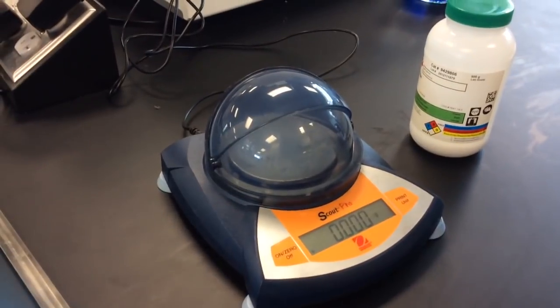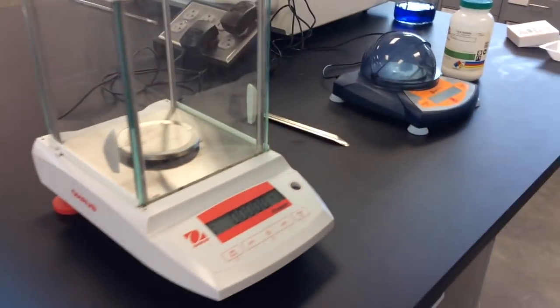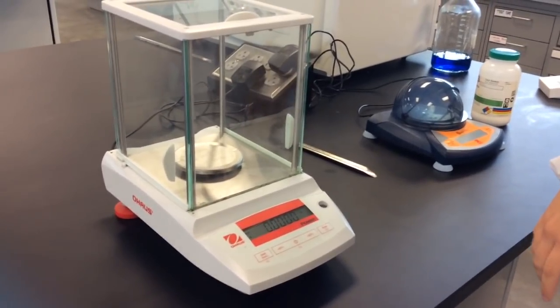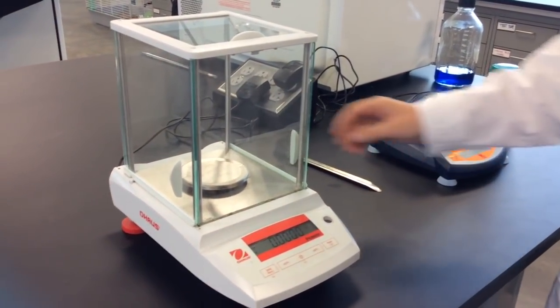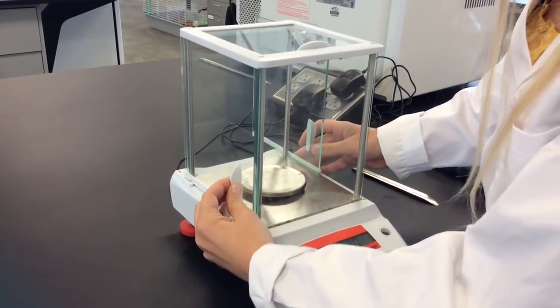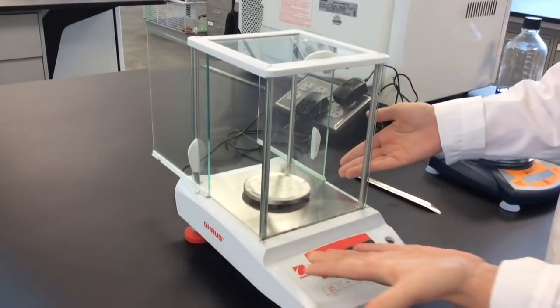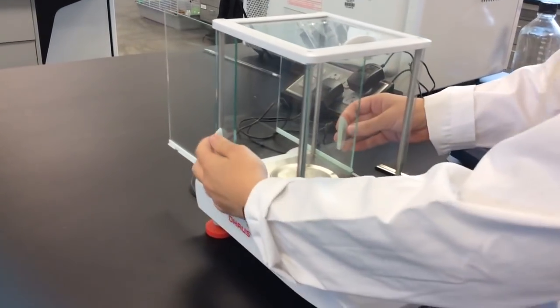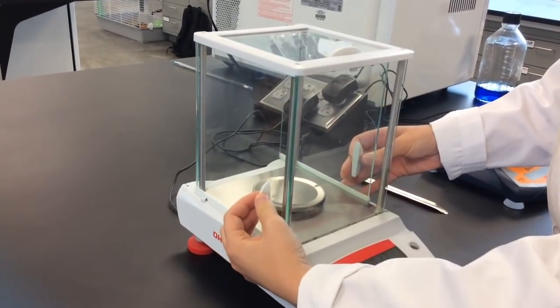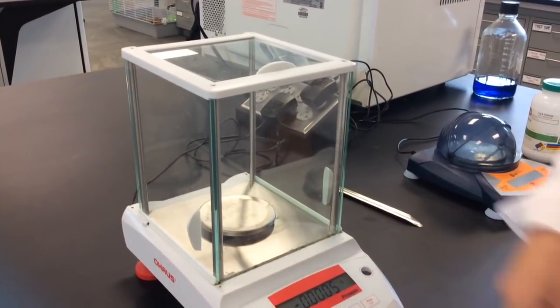We also have this tabletop one — that just hangs out here, and this is what it looks like. One of the things you want to know when measuring and using the analytical balance is that we want to keep the doors closed. We have these cool little doors that sometimes stick.